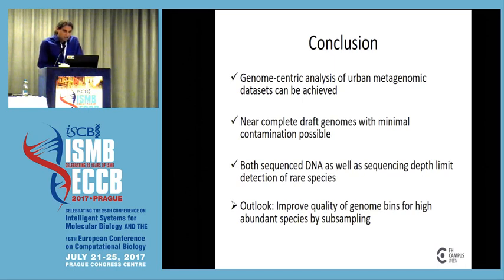I have to say that there are bins which are not really classified, so they're classified as bacteria, not any further. I did not have the opportunity to really investigate them further, but this is one of the very first next steps I want to take, because these are in fact the most interesting ones. They might represent novel species, they might represent some kind of erroneous assemblies, so that needs quite a thorough analysis, but in the end these are the most fruitful ones. So they are there in the data set.